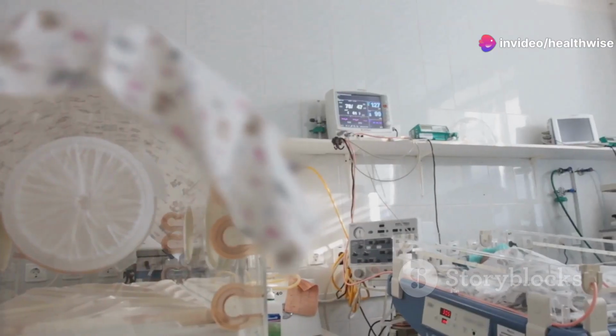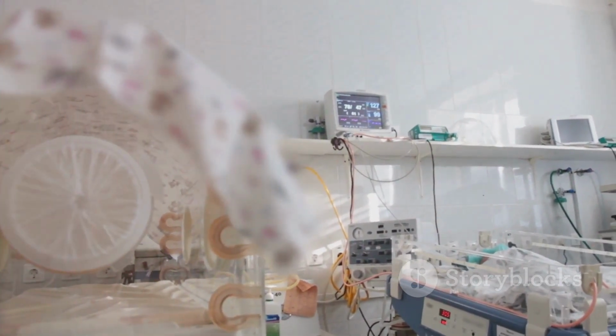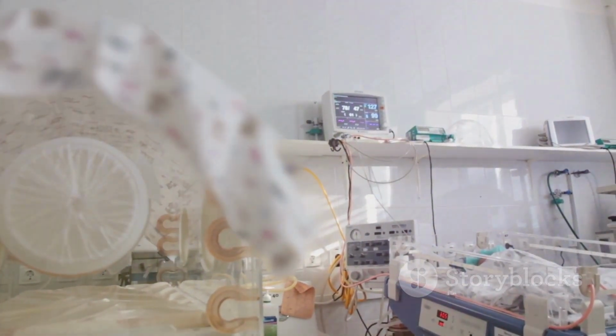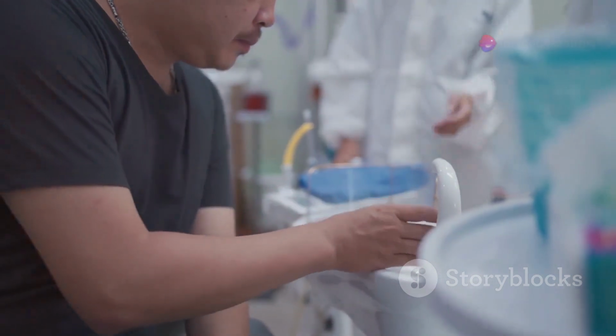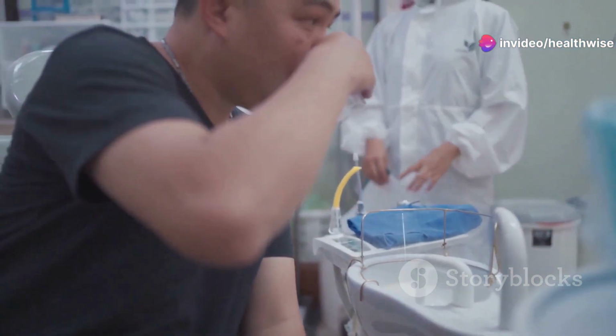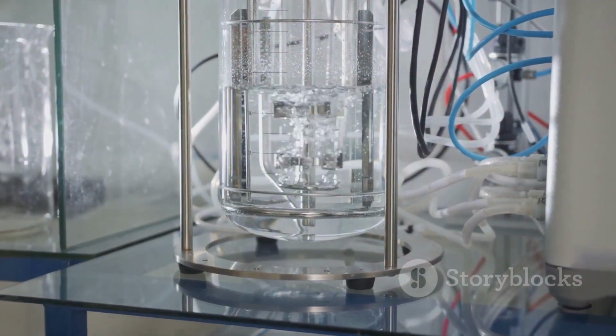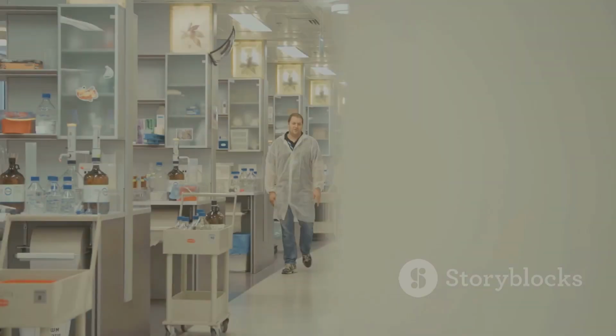There are two main types of incubators, hot and cold. Hot incubators are used to grow and maintain cultures at warmer temperatures. Cold incubators, on the other hand, keep samples at lower temperatures, often for preservation purposes. Each type has specific components and features designed to maintain the required conditions.